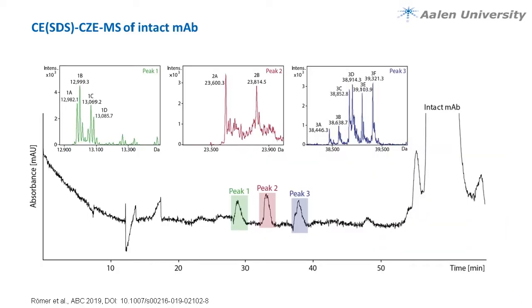All right, so how did we apply that? Just very recently, a couple of weeks ago, a paper appeared from our group showing that you can even couple CE-SDS in this two-dimensional setup, as you have been seeing. But that's not the subject today. You see just that this is possible as well, giving you the size heterogeneity and impurities of antibodies in a very detailed way.